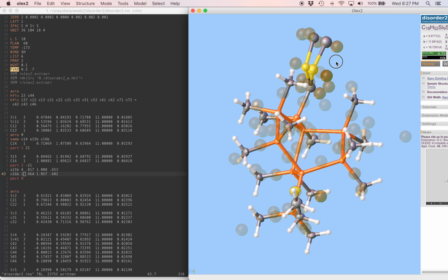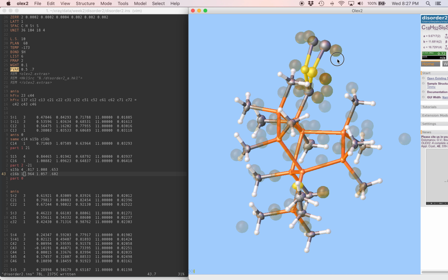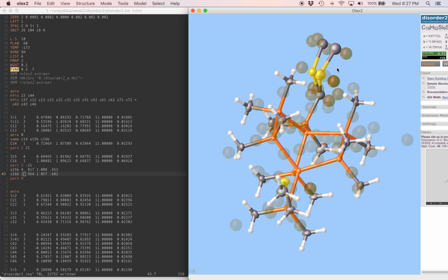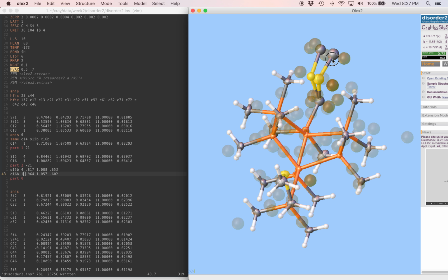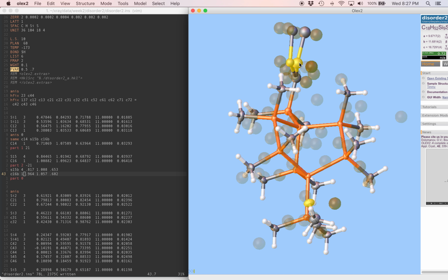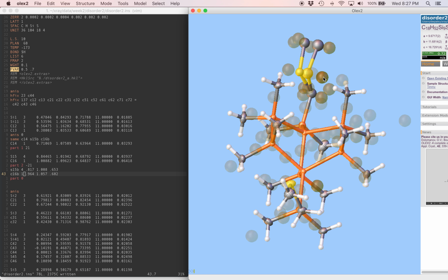Okay, this is pretty much what we were afraid of here. The second position of this disordered chain, it didn't come over here and land on this big Q peak. Instead, it's stuck right next to the first position of this chain. So let's take these coordinates. We weren't sure if we had them right the first time. We'll enter these coordinates.